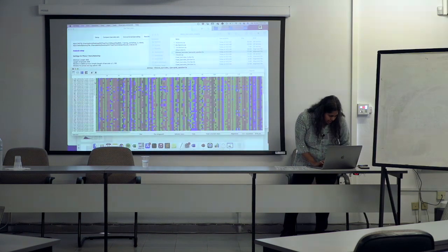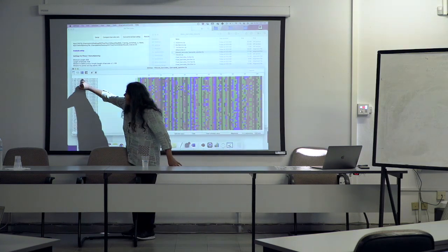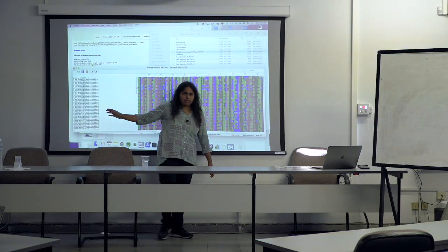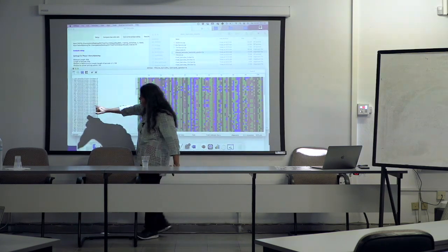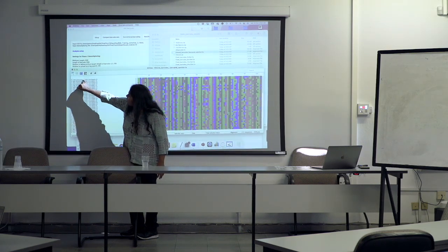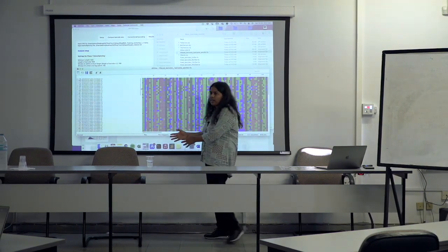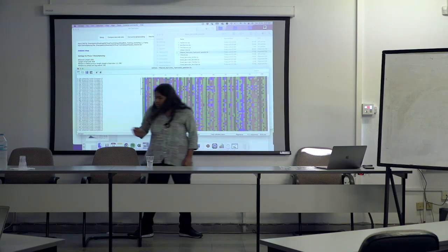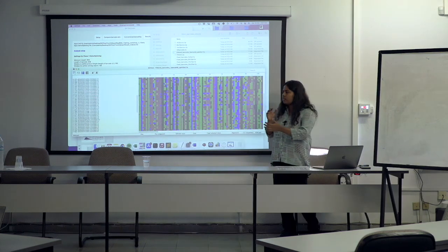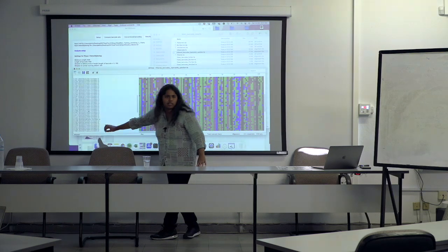All right, so this is the result, FASTA, and ambiguities. The number is the length. This is your coverage used. If you try to call it at 25x, many of them would have been called at the first step itself. That's why everything is kind of standardized at 25. Some of them had 37 reads only, so at the 50x stage, it would have called it with the 37 reads that it had. It also goes into fewer reads than 25. So just keep in mind, 25 is the maximum coverage at the subsetting stage, not the minimum coverage. So you may have 17 reads, and something has been called.